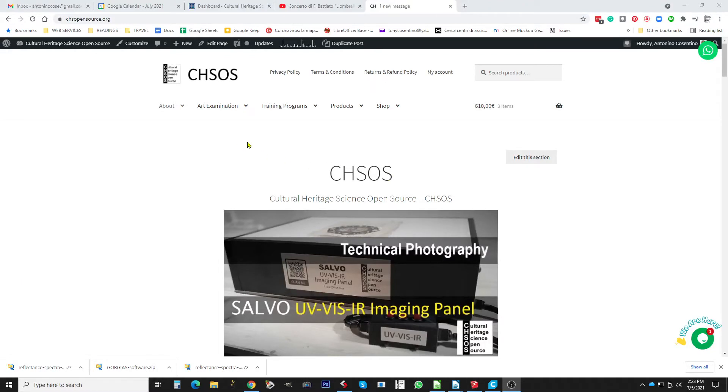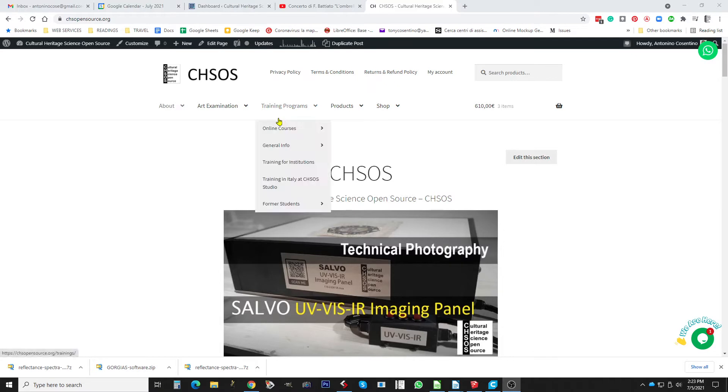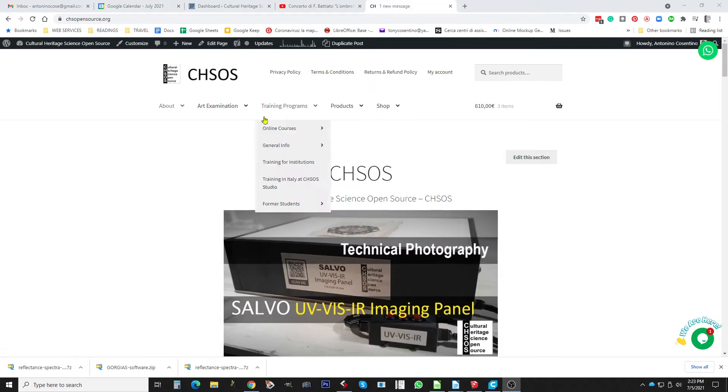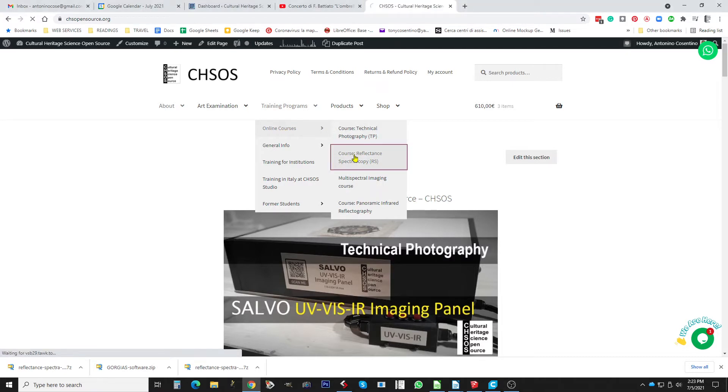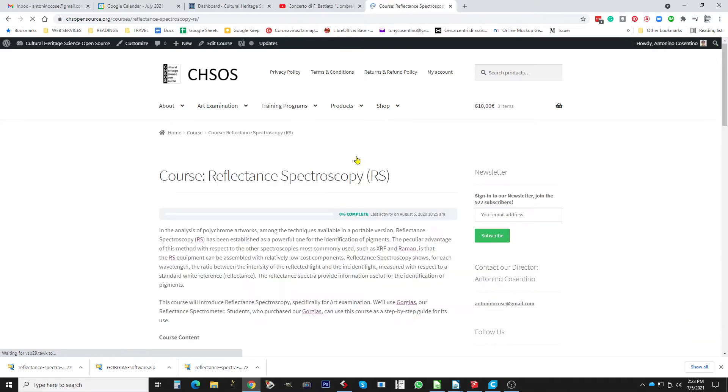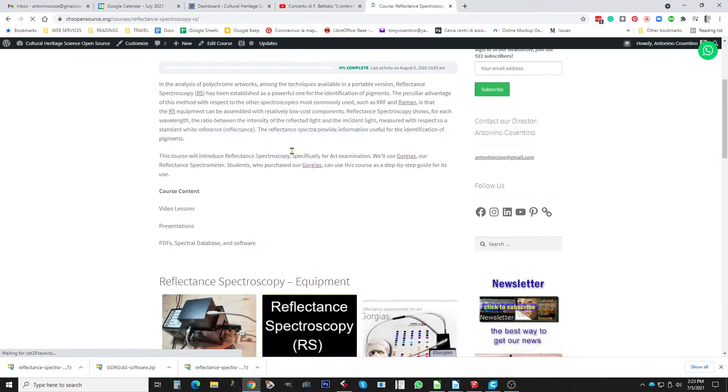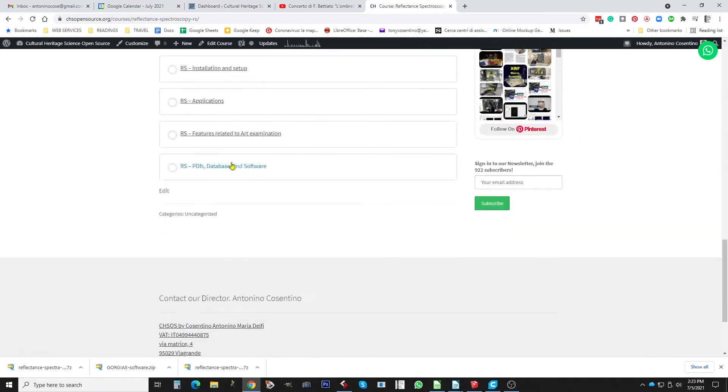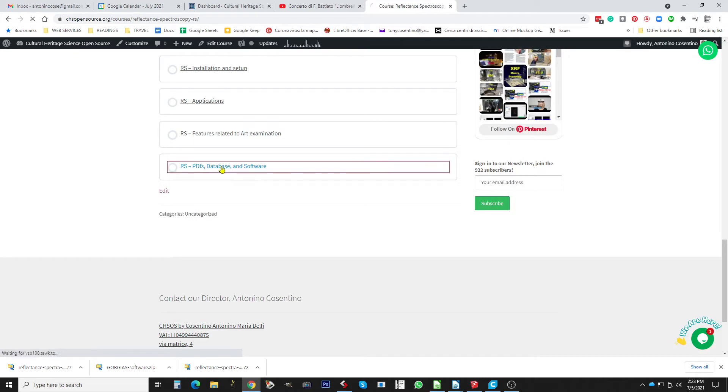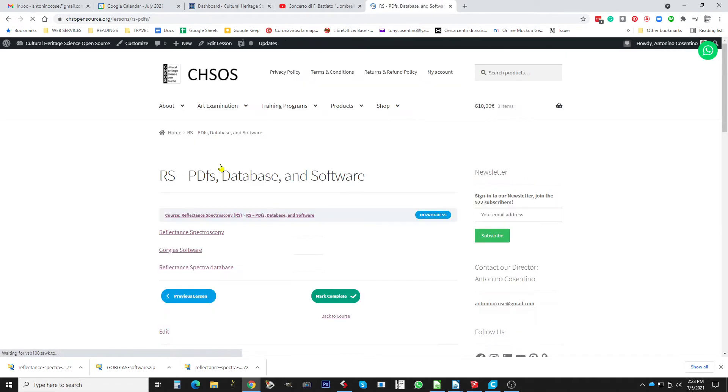We show now how to use the database for reflectance spectroscopy. First of all, you go into training program online courses reflectance spectroscopy. From here you can download from this lesson, you can download this software just to have the updated version.